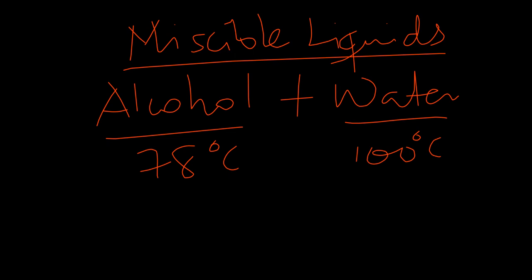What it means is that alcohol would always boil first before water if you mix the two together and heat the mixture, because you need a lower temperature to boil alcohol than that of water. Now, you can make use of the boiling point to separate liquids mixed together. So let's see if we can apply this concept in separating the alcohol from the water. We have two different boiling points, remember. That's what we are going to look at. That's where the concept of fractional distillation comes in.